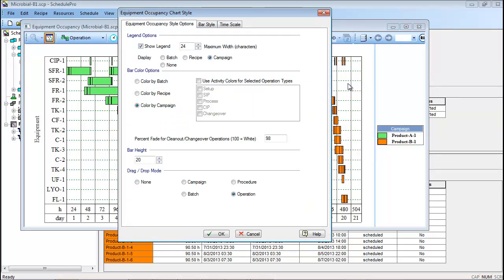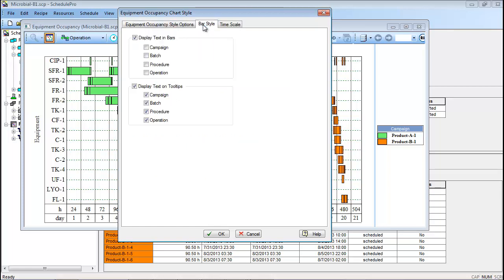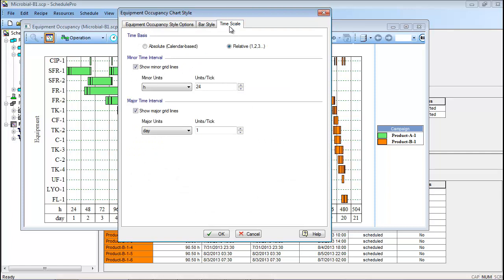Here, you can specify that the chart color scheme should be based on batches, recipes, or campaigns. Note that there are also tabs which allow you to change the bar style and the timescale at the bottom of the chart. It is also possible to change the timescale to calendar-based rather than a relative basis starting at Day 1.